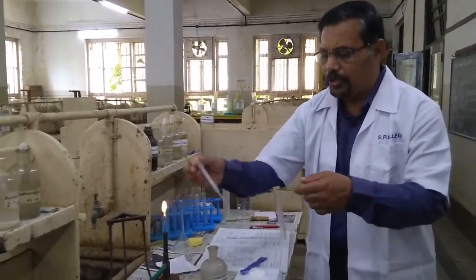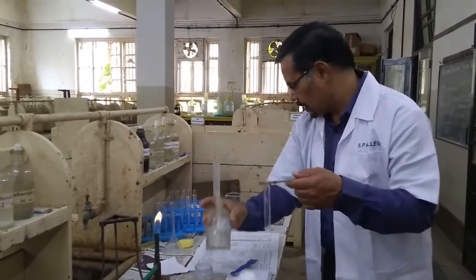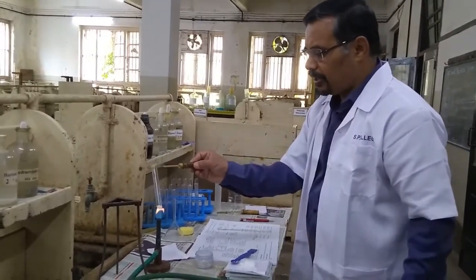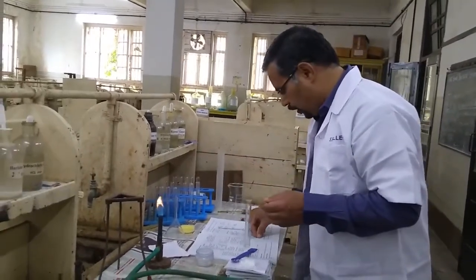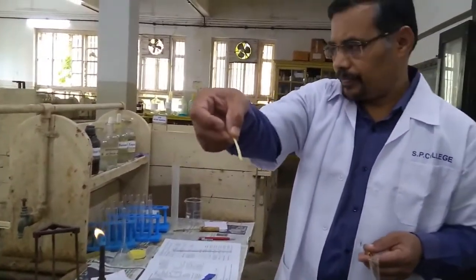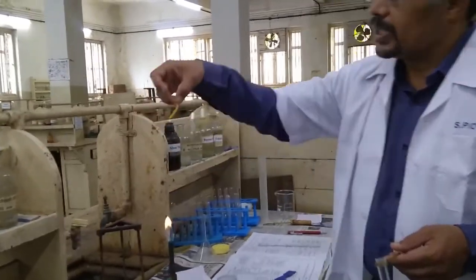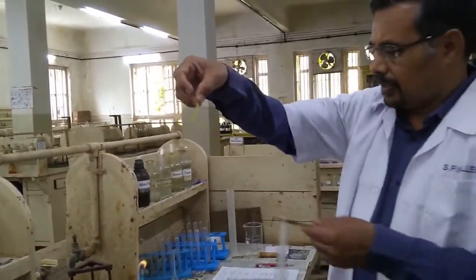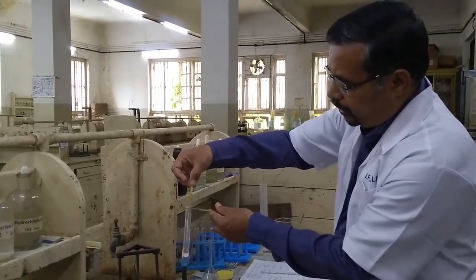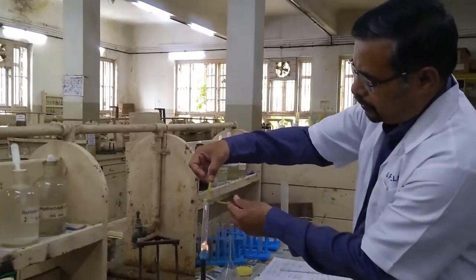So a small quantity of dilute NaOH is added in the given mixture, and if it is heated, then during heating I will hold this turmeric paper. I will make this turmeric paper moist. Then I will hold this turmeric paper on the mouth of this test tube.